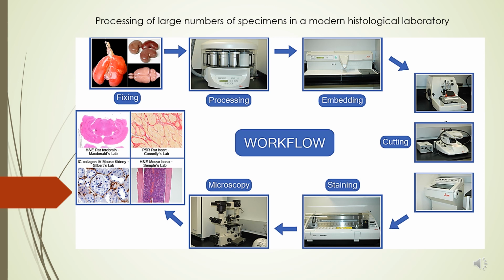Histological laboratory tests are one of the cornerstones of modern evidence-based medicine and are essential for correct diagnosis. The work of a modern histological laboratory in large medical organizations is based on the sequential processing of a significant number of specimens through the stages of histological processing using automation of the most time-consuming processes.